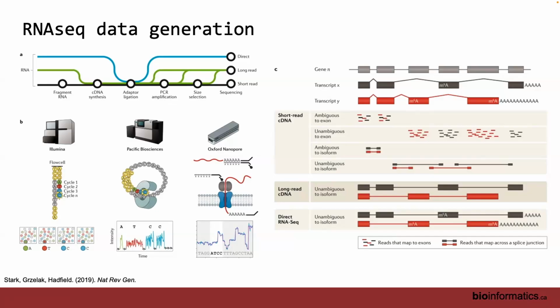So the other reason you need to know where your data come from is so that you can learn to expect what you would see if you visualize the data at a particular level. So if I got just my fragments, I'm jumping ahead of myself, but basically when you visualize your fragments, they should look a certain way. They should be spread out across the gene. They shouldn't just all be at the 3' end, for example, right?